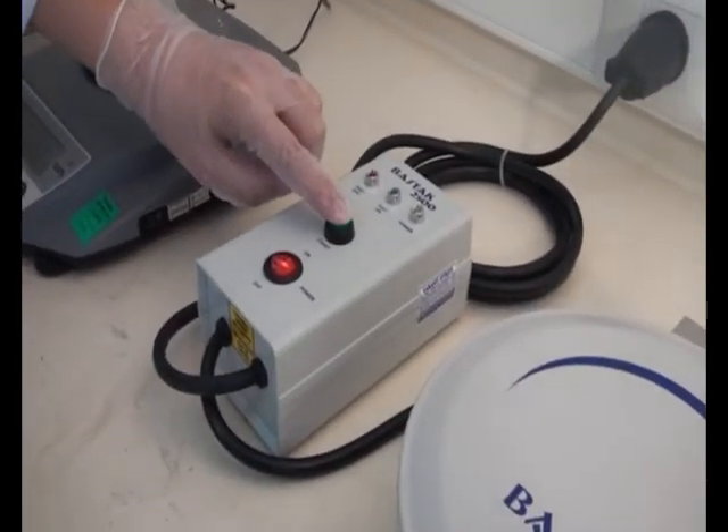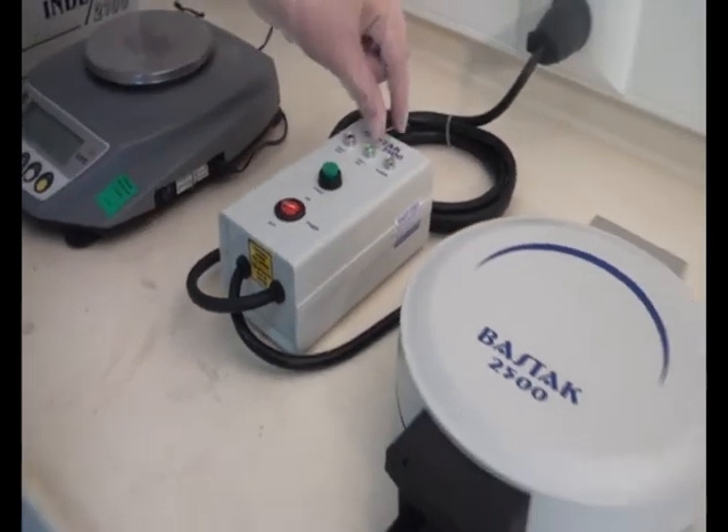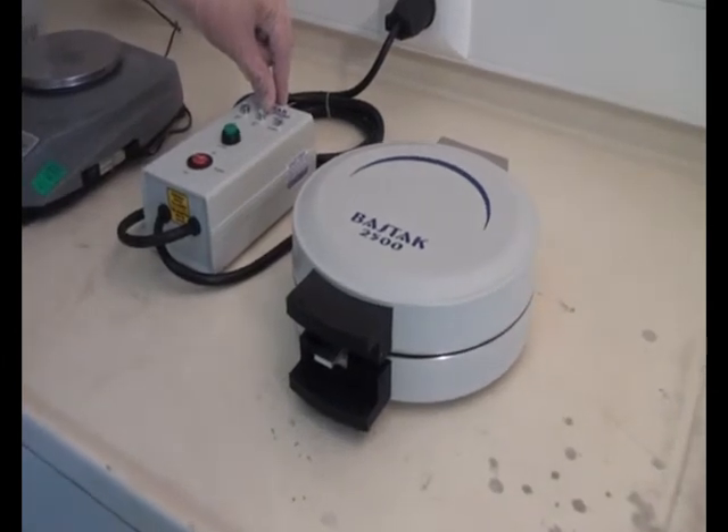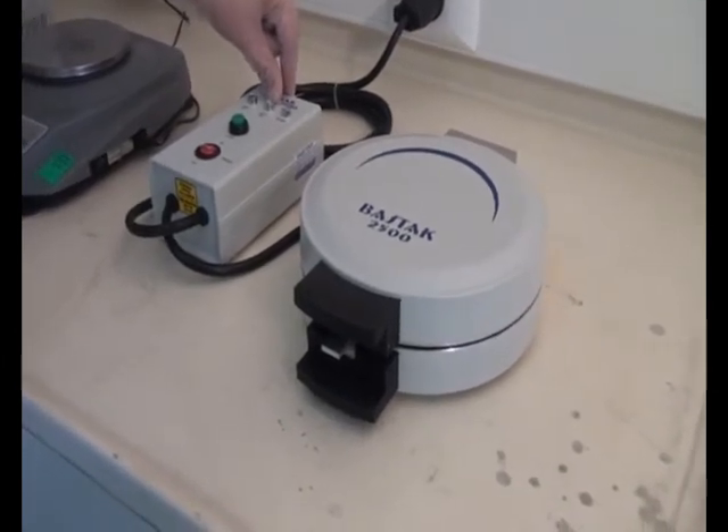Press the start button so the test on light will turn on. The test period is four minutes.